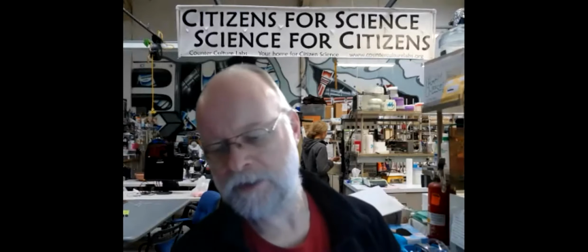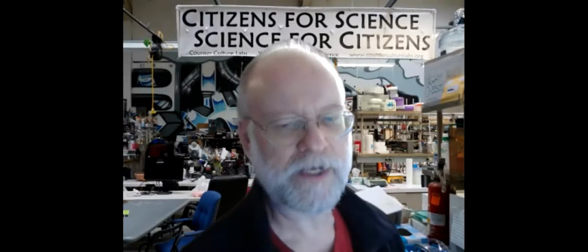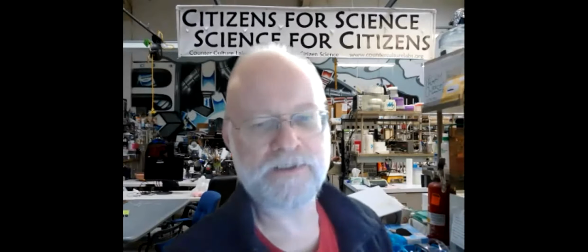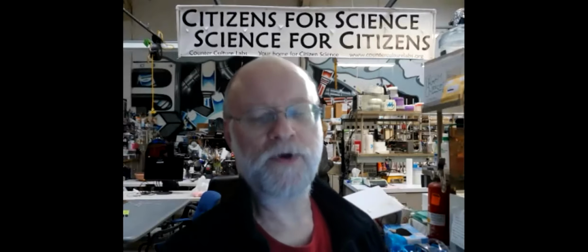But I always wanted to try it because it seemed like a cool protocol. And if you're working with chromoproteins, they're protein-based pigments essentially. Eventually, the proteins are going to degrade. But there's ways of working with natural pigments that actually will stick around even after the cells are long dead, right? So you can make it permanent. You just have to do a little bit more engineering.